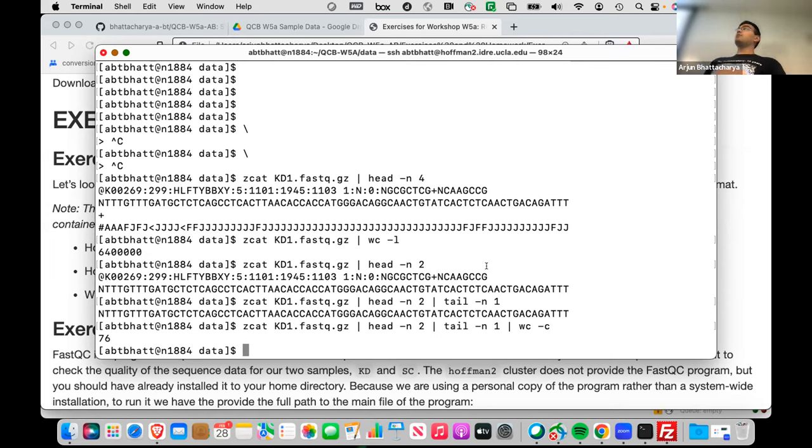But this is precisely why long reads are, cost aside, if we had unlimited money, we should all be running long read sequencing. Sure, there are quantification errors with long reads, but if you can cover an entire gene with a single read, there's going to be much less opportunity to have these multi-mapped reads. And that solves a lot of problems for you.